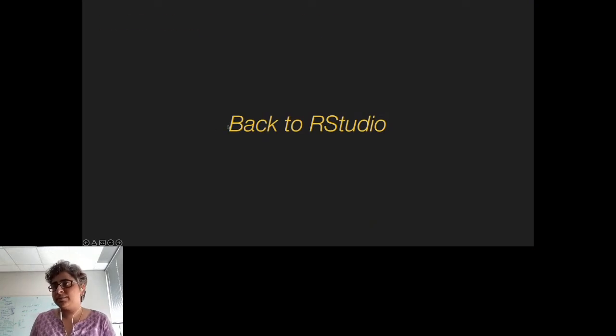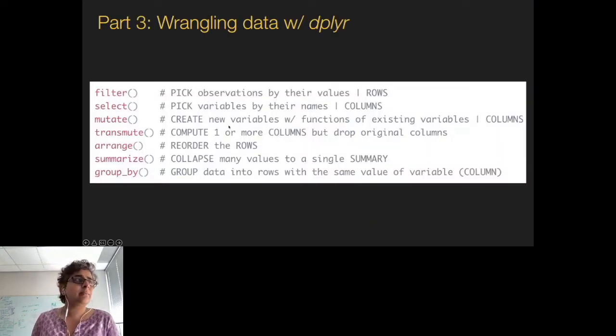Okay, great. So any questions so far? Because we are moving into part 3. Now might be a good time to ask any TidyR related questions.